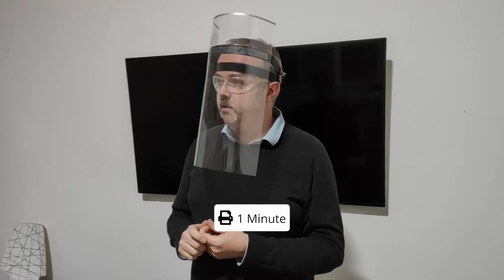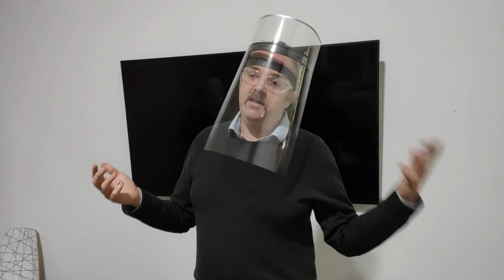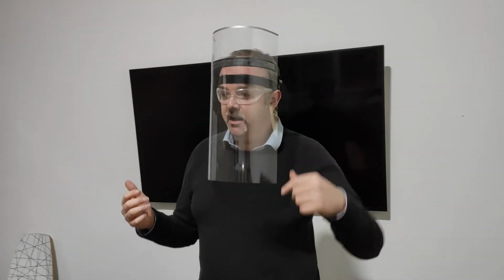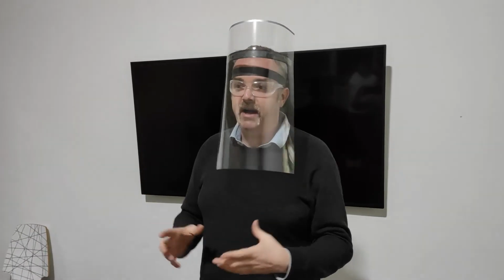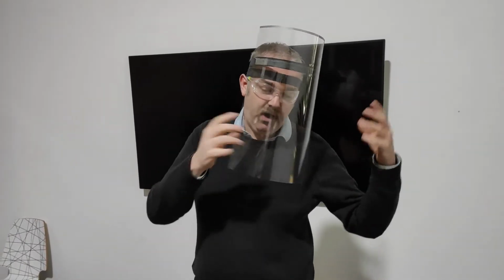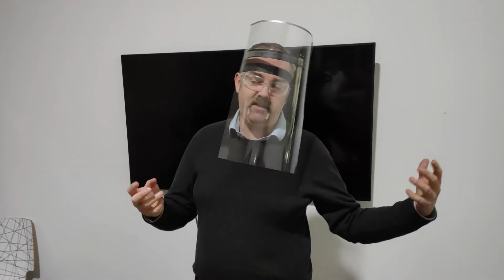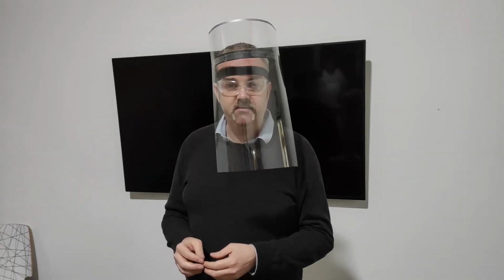I'm not sure what the polypropylene cost is, because it's some that we had, it's at the moment cut out of offcuts from when Tri and Lily were cutting hat patterns for their manufacturing process, and this was one that didn't quite cut through properly and they had left lying around, so I'm just using that because it's spare, lets me experiment with stuff. But I don't think polypropylene is particularly expensive.